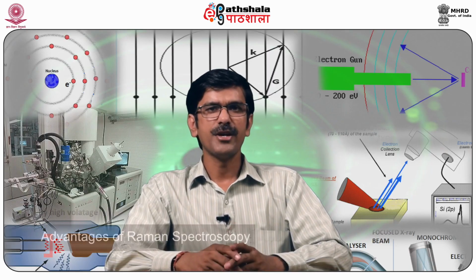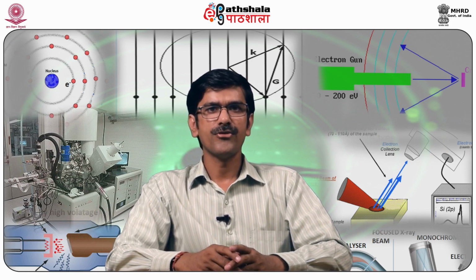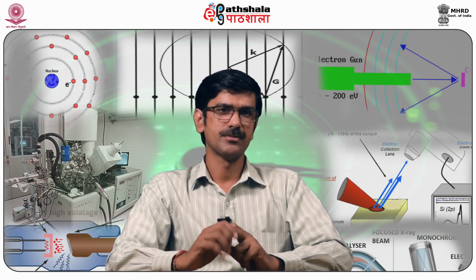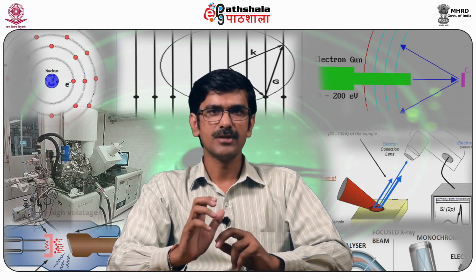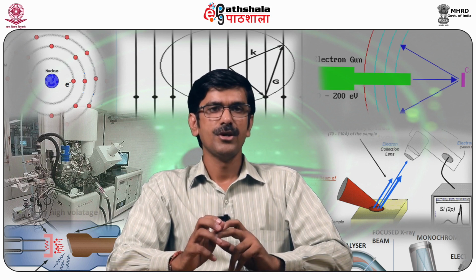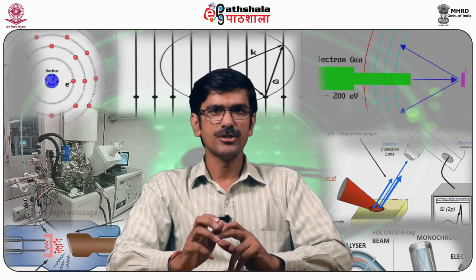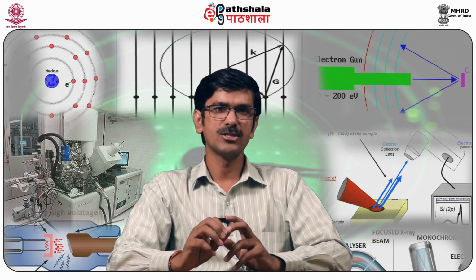Now, the advantages of Raman spectroscopy. It provides molecular fingerprints of each analyte. It provides the possibility of highly selective determinations. It is applicable for any optically accessible sample, that is, organic, inorganic or biological. Solid, liquid, gases, transparent and non-transparent samples can be measured. Aqueous solutions present no special technical problems, and sample scanning is non-invasive.